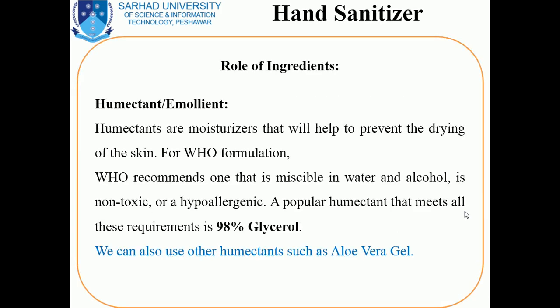The second ingredient we will use is termed a humectant or emollient. Humectants are moisturizers that help prevent drying of the skin.